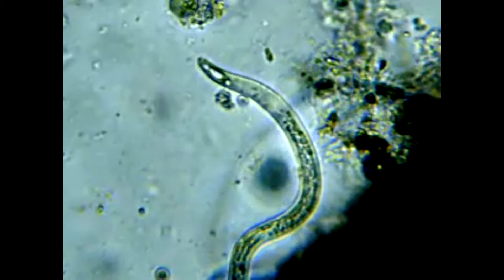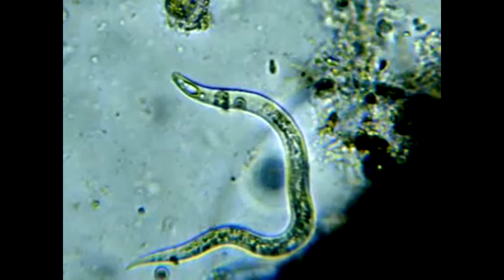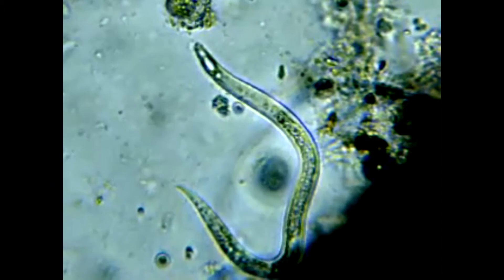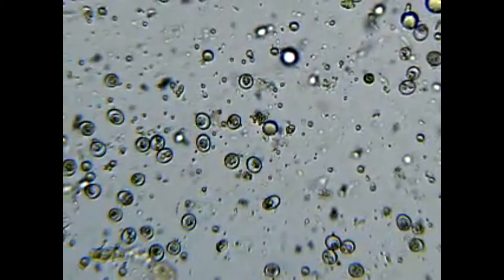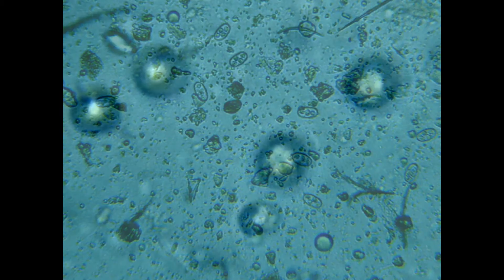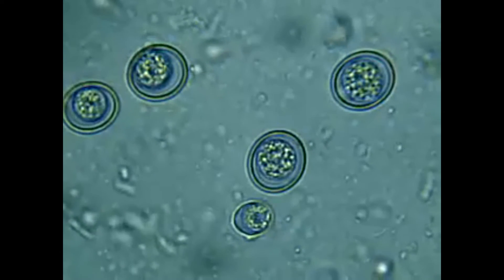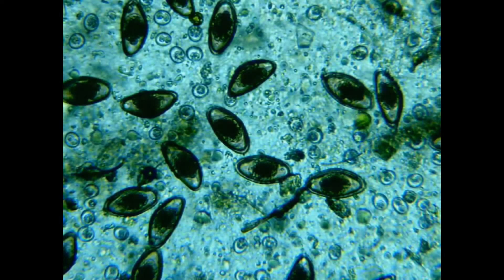Here is one that has already broke out of the egg and is ready to find a new host. Here is an example of what coccidia looks like at 200 times and at 400 times magnification. It is not uncommon to find more than one type of parasite on a slide — here is coccidia and pinworm together.